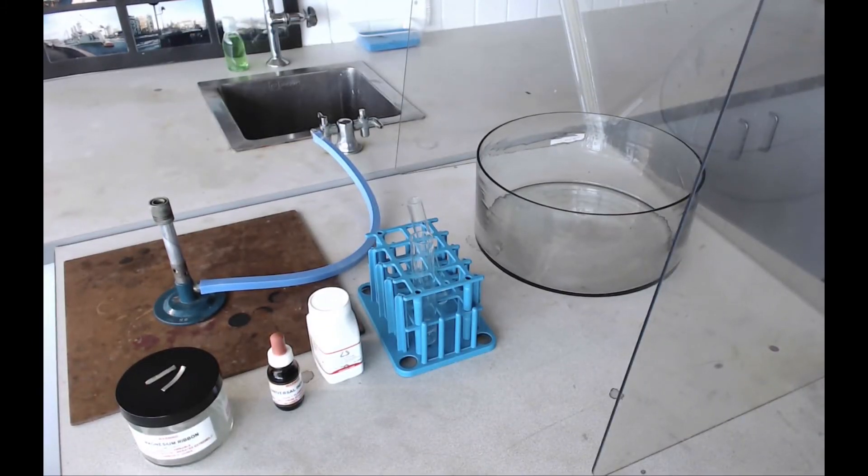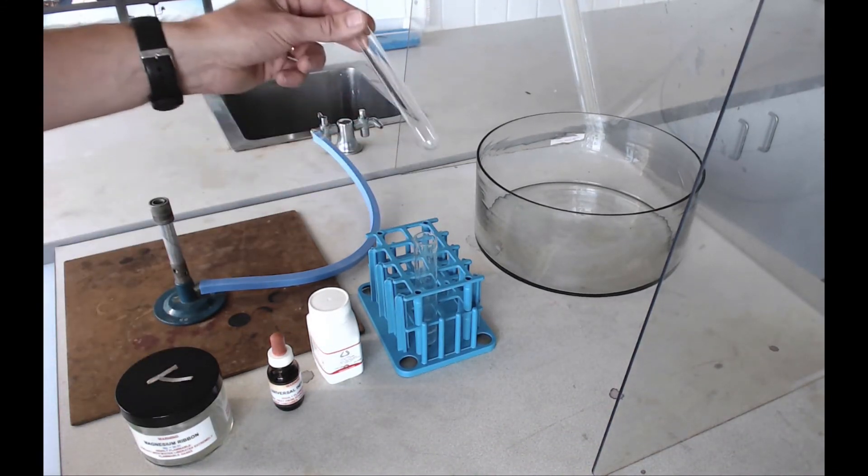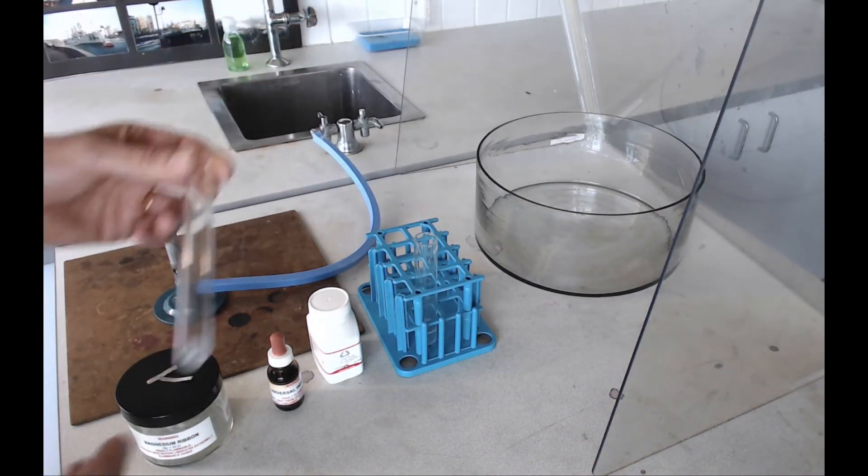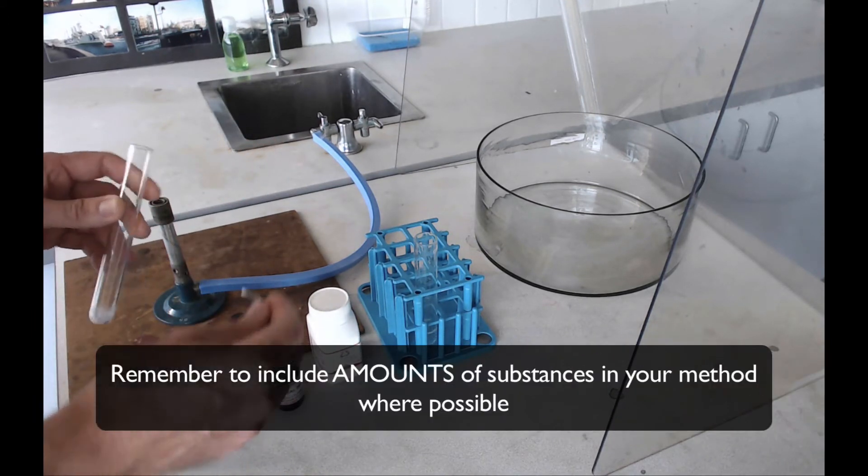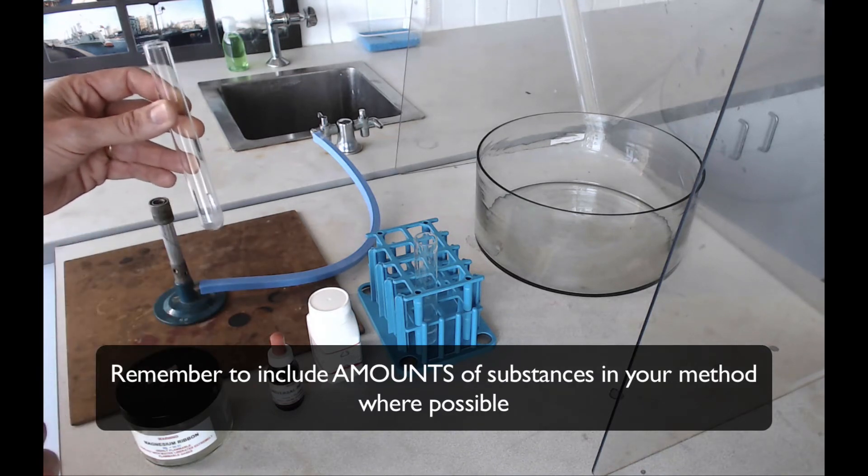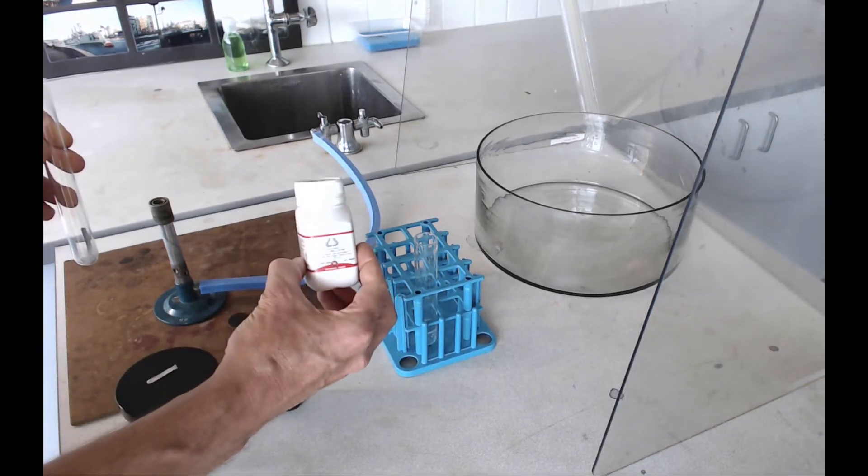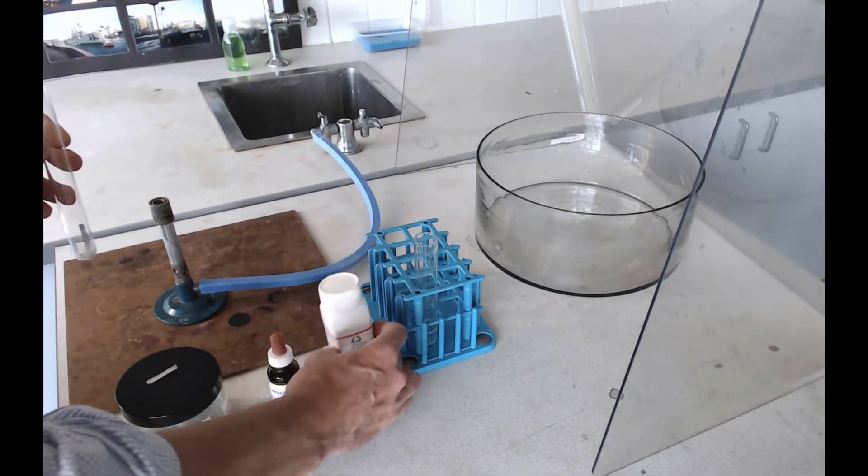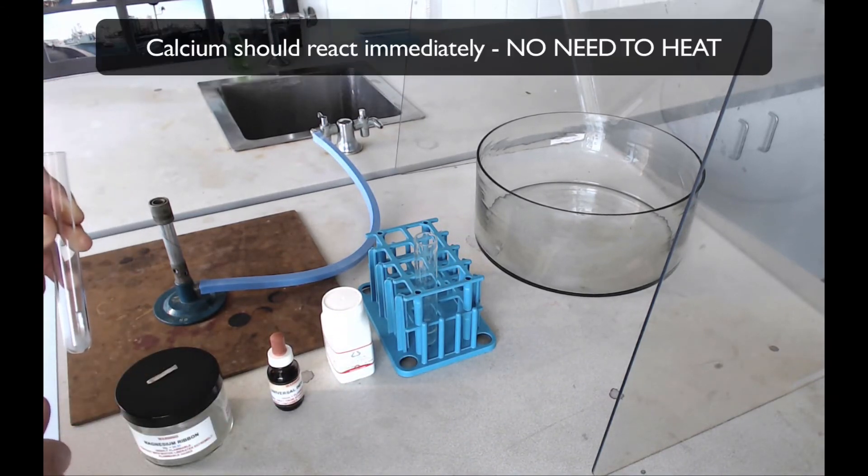There are certain similarities between that and the practicals that you're going to do, except you're going to do yours on a smaller scale in a test tube of water. The test tube needs to be about half full of water. You're going to drop your metal, whether it's about a two or three centimeter strip of magnesium or about a small spatula full of calcium granules, in separate test tubes of water, and you're going to observe how those metals react.